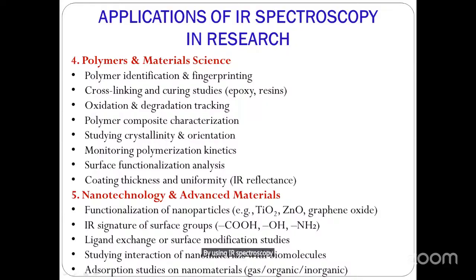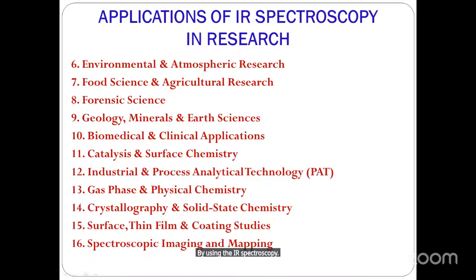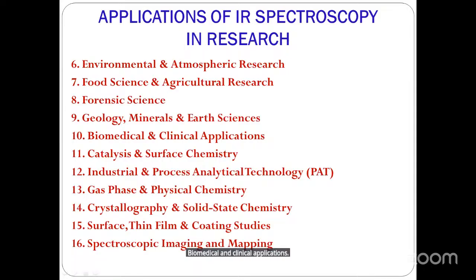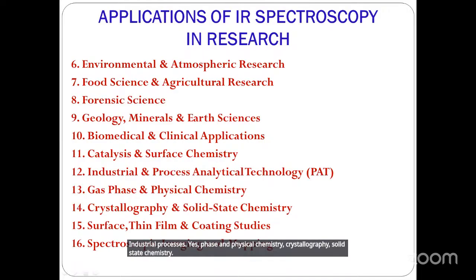The surface phenomena can be studied by using IR spectroscopy. These are various applications of IR spectroscopy such as environmental and atmospheric research, food science, forensic science, geology, mineralogy, earth sciences, biomedical and clinical applications, catalysis and surface chemistry, industrial processes, gas phase and physical chemistry, crystallography, solid state chemistry, surface and coatings.